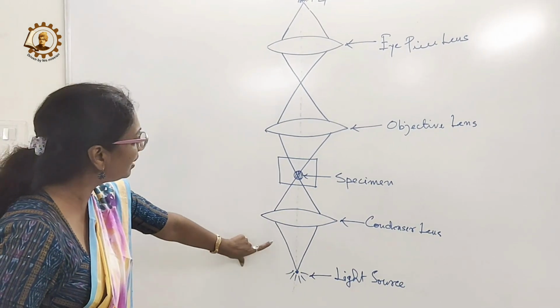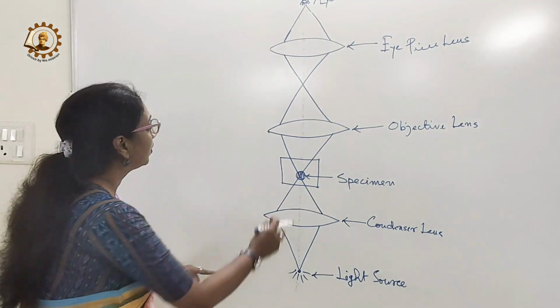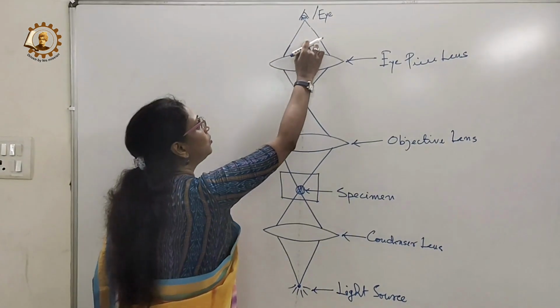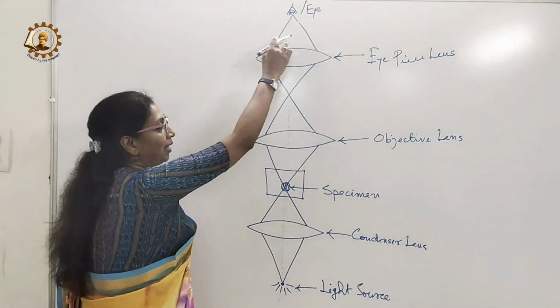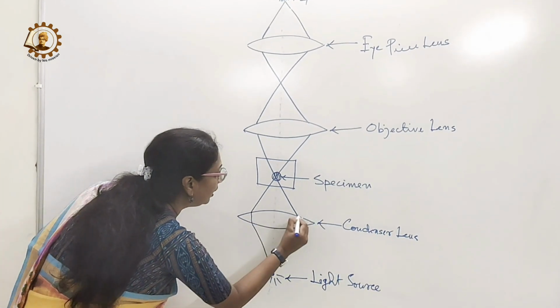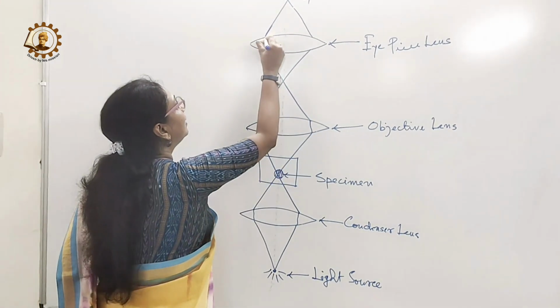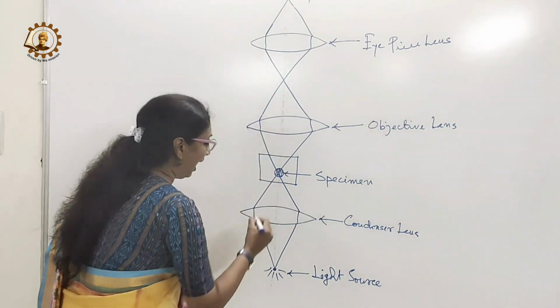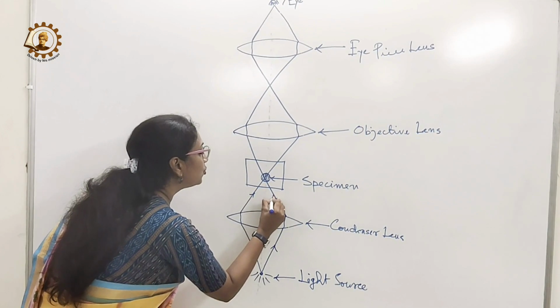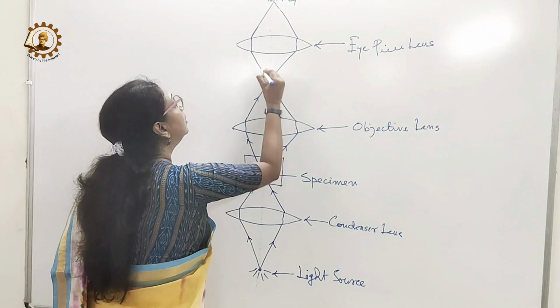To see the optical pathway, the first part looks like the English capital letter V. This is one X, then another X, and the last one looks like an A. So this is very simple to draw, and now we need to finish it by drawing a few lines to join the rays, and we just need to mention the direction of the light rays. This is very important.